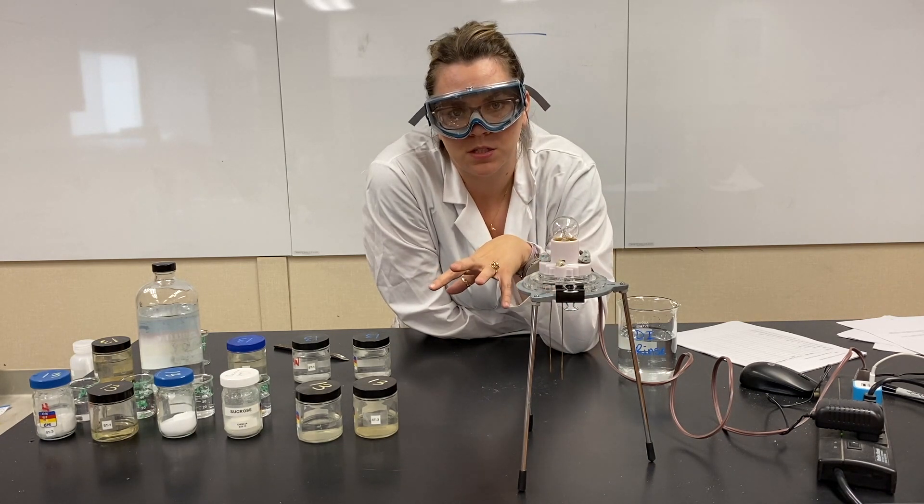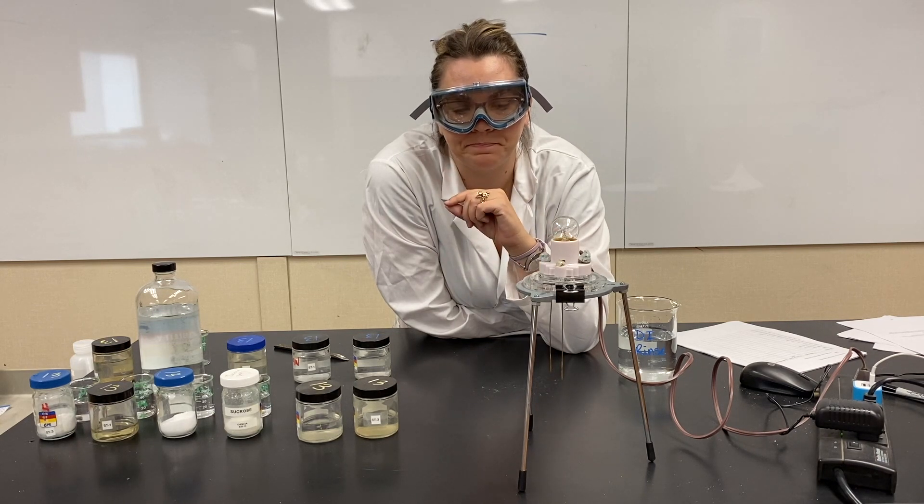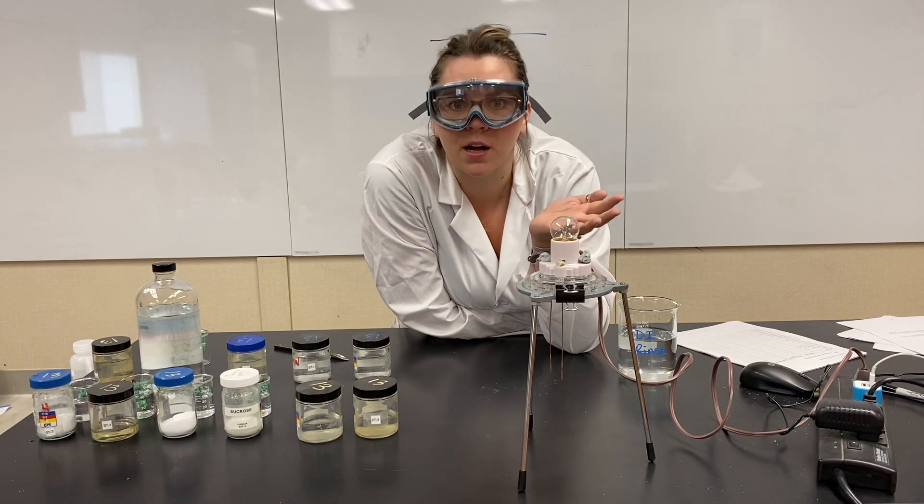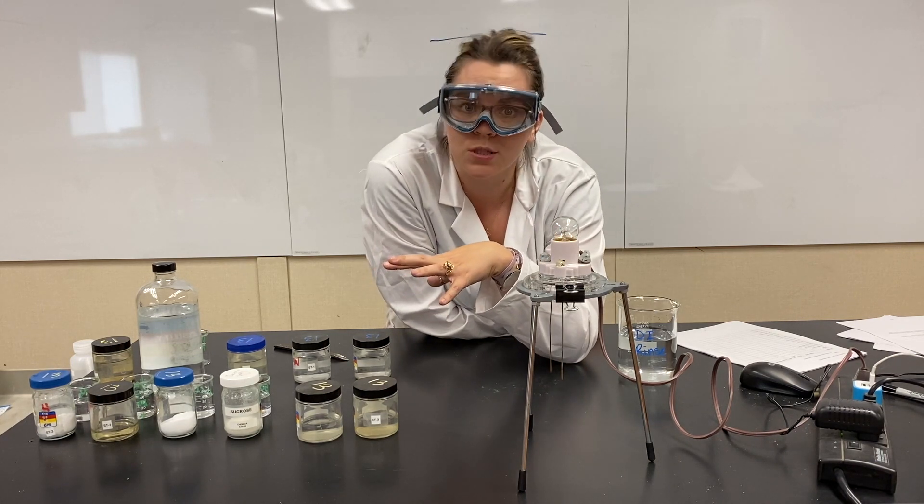The more ions that are in a solution means the more able it is to conduct electricity. That's why it's called electrical conductivity. We're going to conduct electricity through solutions, which is pretty cool, right?